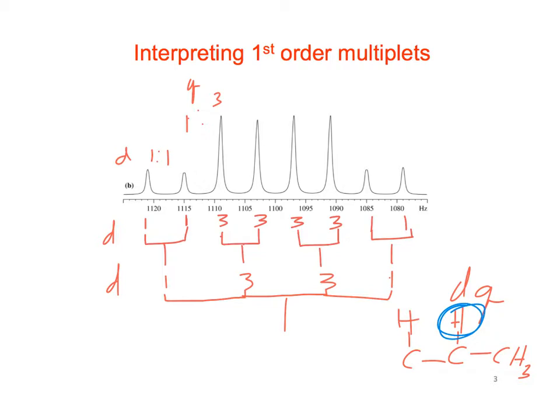Yeah, so it could be, I guess, maybe if these carbons here were part of a ring or something like that, then those coupling constants could be very different. If this was part of a chain, then those coupling constants would probably become more similar. Yeah, that's what I was thinking. Yeah, because we get more average coupling constants.